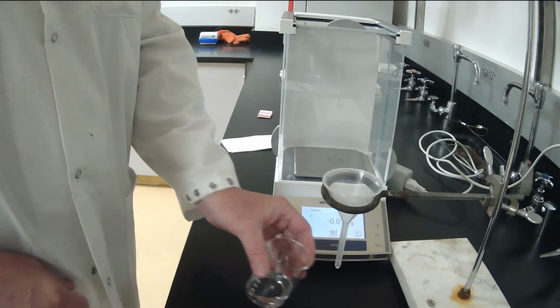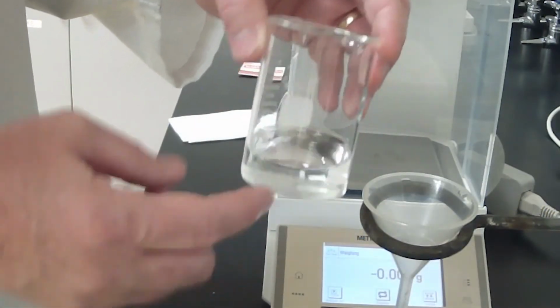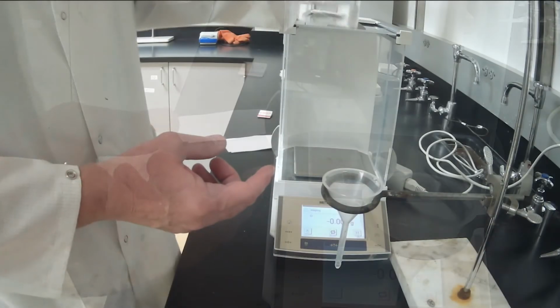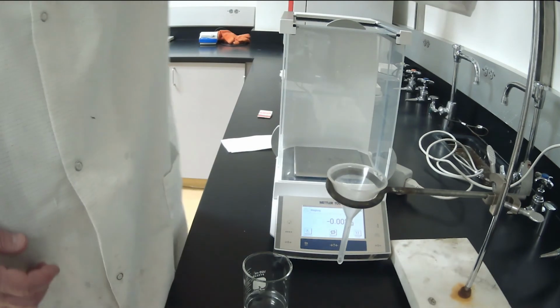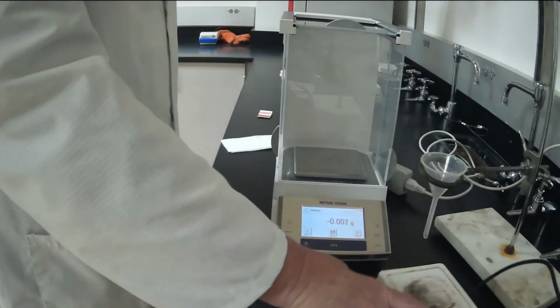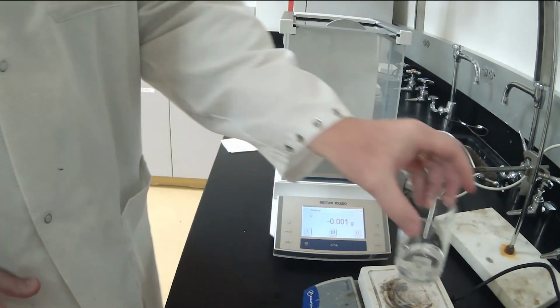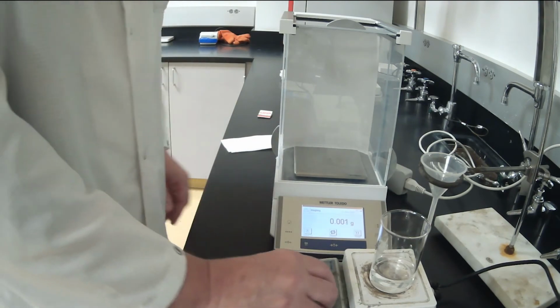Now what's left in here, look closely, is a nice clear solution that should have captured all of our sodium chloride dissolved in the water. So we are going to now begin to evaporate that. And we'll set this here. We'll crank the heater to high.